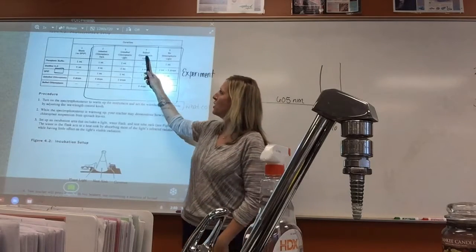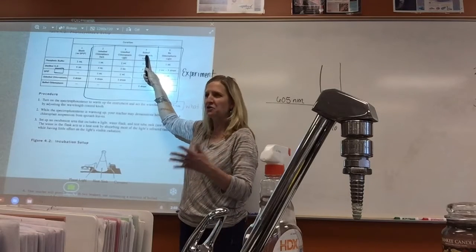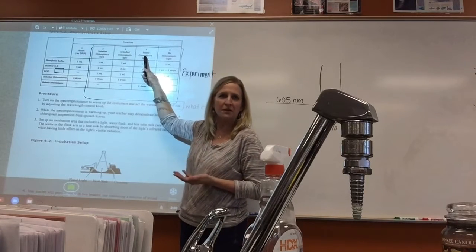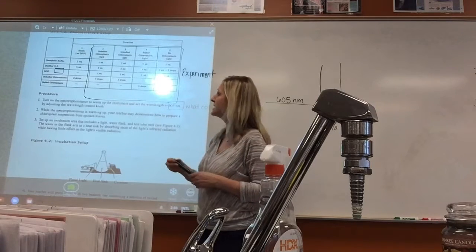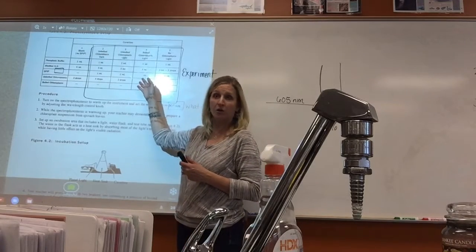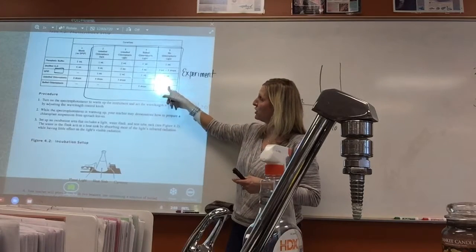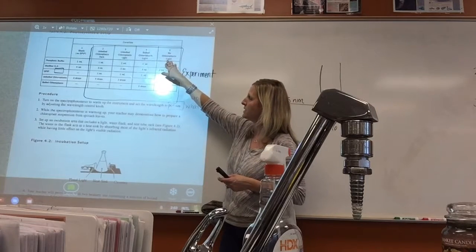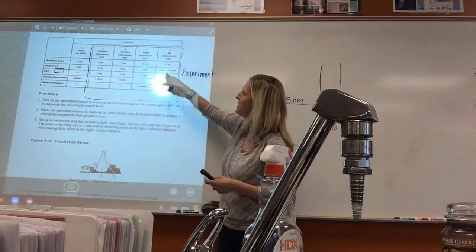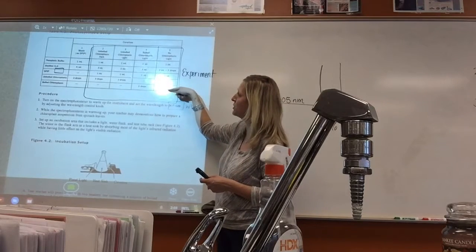And so therefore, the chloroplast is still present, but you are denaturing it and changing the chloroplast, and therefore it's testing if the intact chloroplast is needed. Part of that chloroplast is all the enzymes involved. And this one is more clearly testing the chloroplast hypothesis, because they're not putting any chloroplast in there. So no drops of chloroplast, boiled or unboiled.